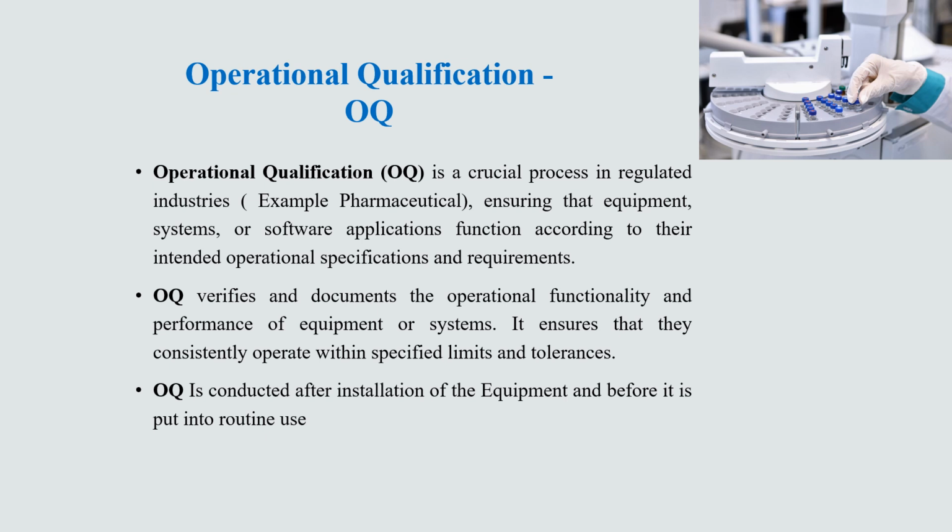OQ verifies and documents the operational functionality and performance of equipment or systems. It ensures that they consistently operate within specified limits and tolerances. OQ is conducted after installation of the equipment and before it is put into routine use.